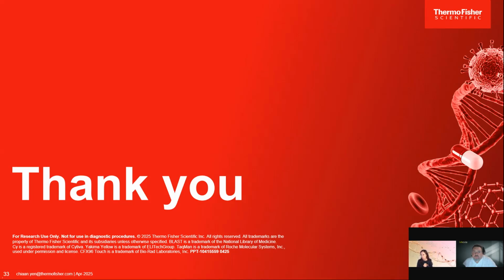That is a good question. I can imagine you probably want to do that anyway if you're trying to detect different splice variants within the same sample.